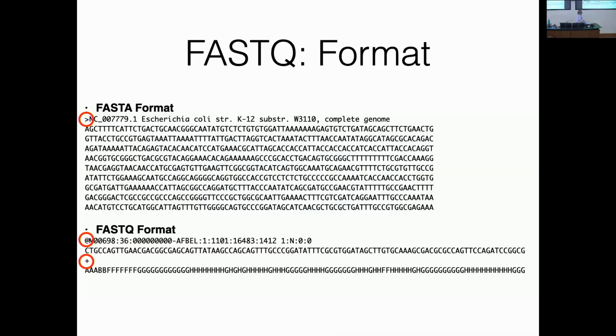Okay, so this is just showing you one read. Usually when you get FASTQ files, it's hundreds of thousands to millions of reads in a file. So it looks like this, continuing on down, miles into the earth at this scale, right? So each of these, you can see the @ sign, you can see the header after that, you can see the sequence, the plus sign, and the quality score. And so each of these is a separate read. Okay? Questions about that?